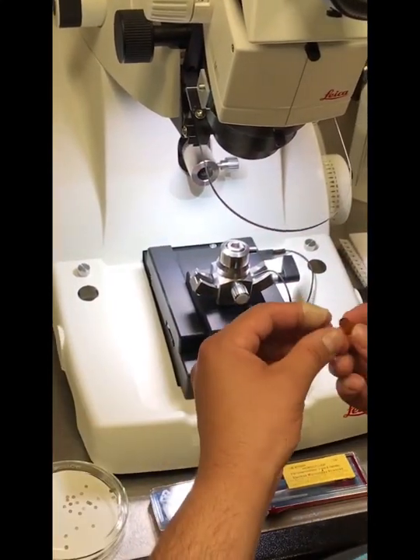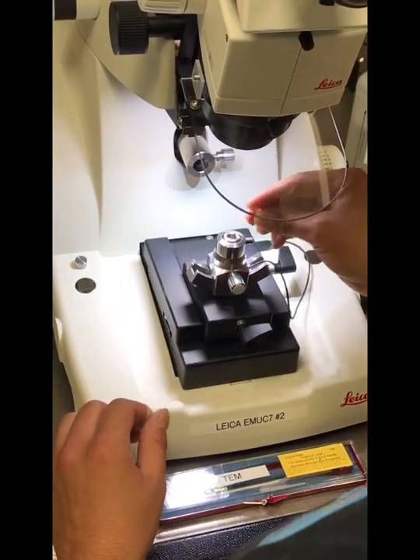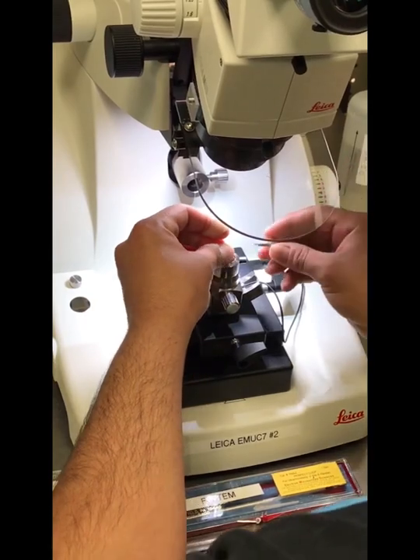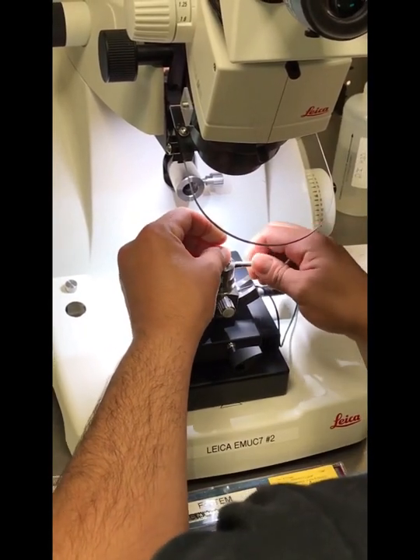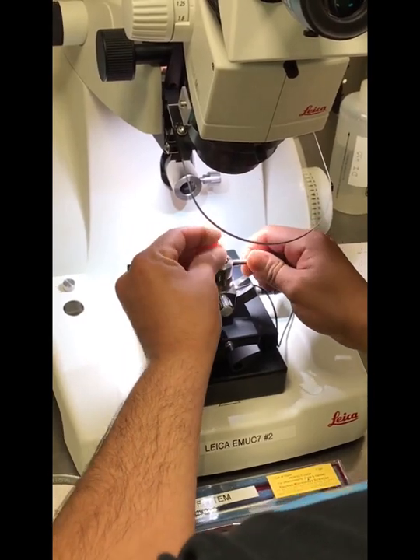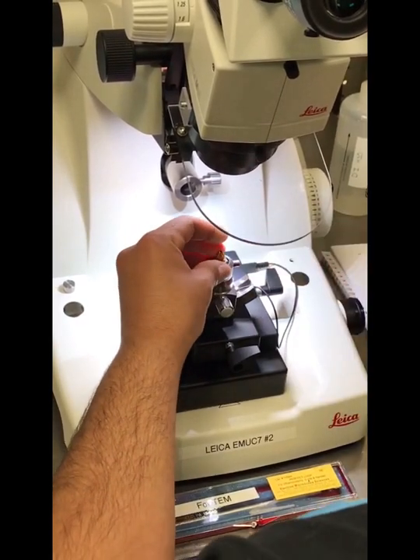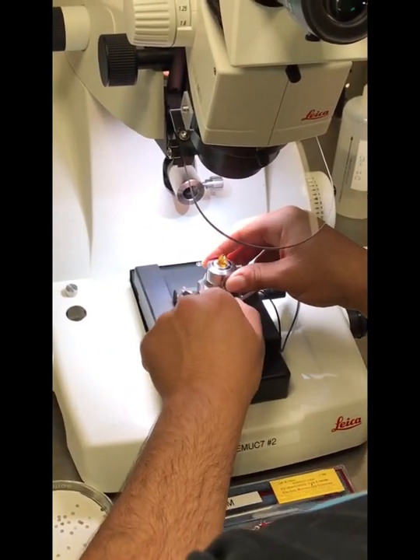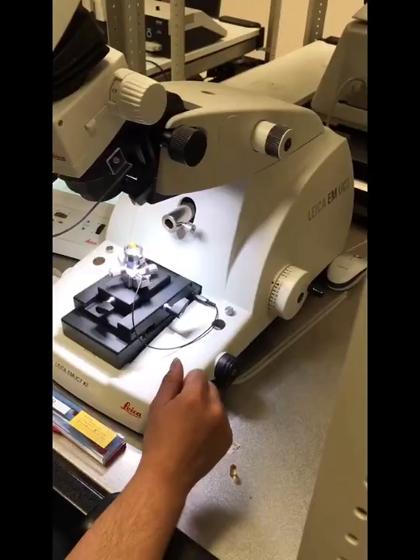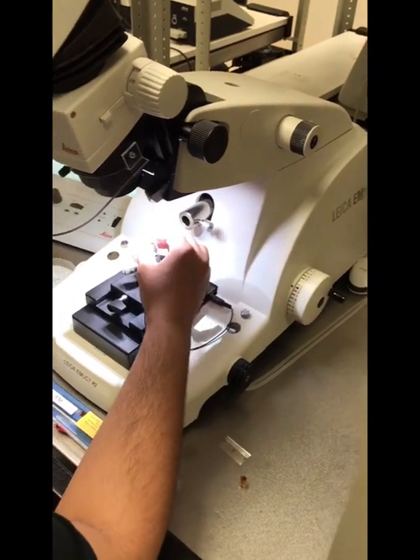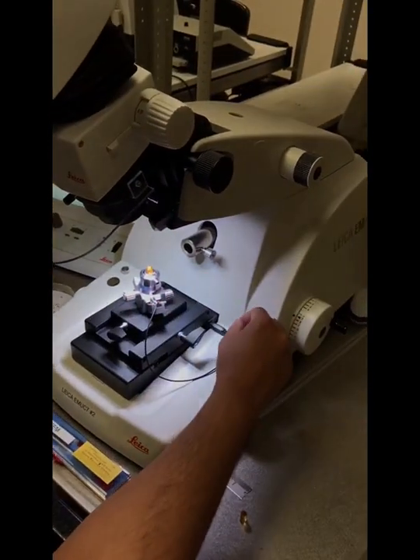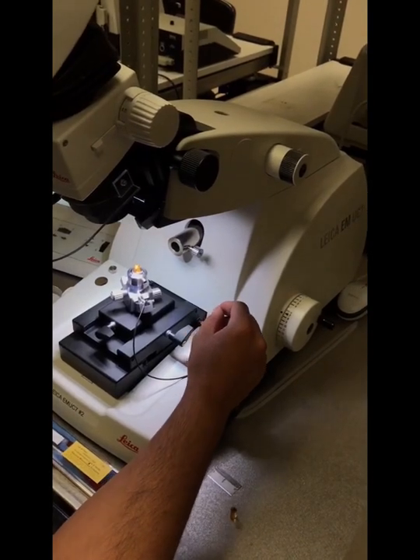Put my untrimmed block in the holder, and tighten with the special Allen screw. Make sure it's tight and secure. Okay, so once the block is inside of this holder here securely, we can start facing.